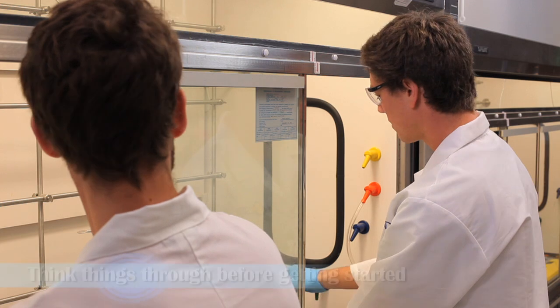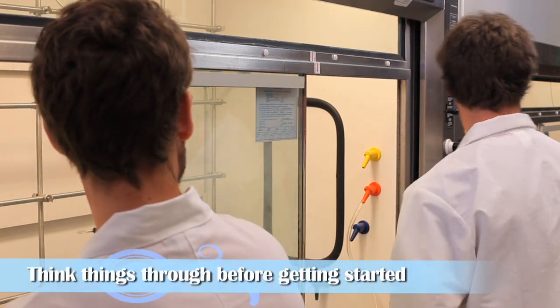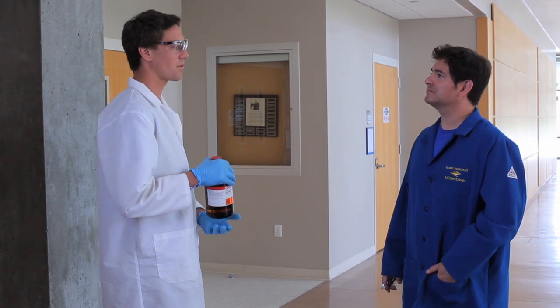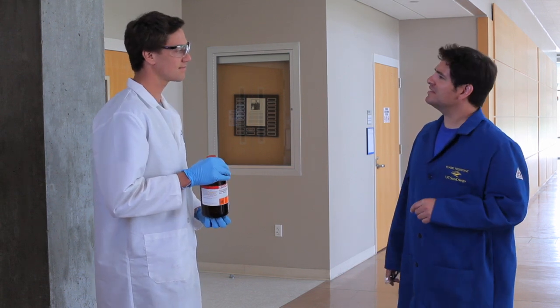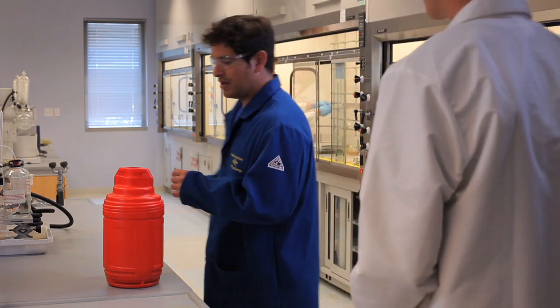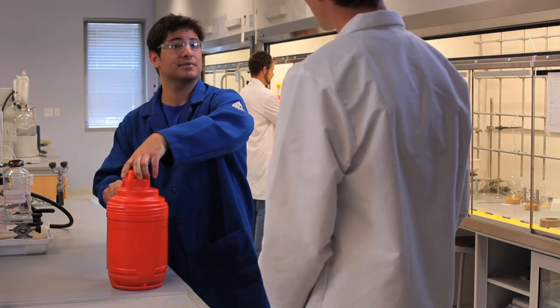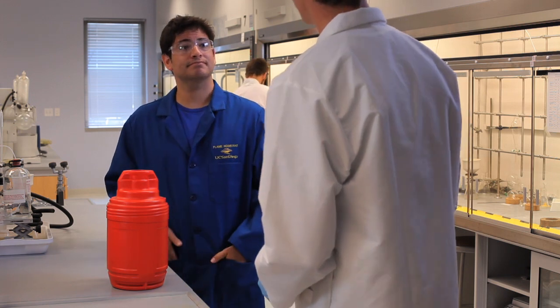Hey Andrew, do we have any DMA left? Looks like we're just about out. I'll run to the stock room and get some more. Good morning, Professor Rios. Hey Andrew, how's the lab going? Pretty well — I'm just on my way to the stock room to fill this reagent bottle. You know, I think you're missing something though. It's much safer if you transfer bottles using a secondary container, because it offers better protection in case the bottle falls and breaks. And don't forget to take off those gloves before you leave the lab.